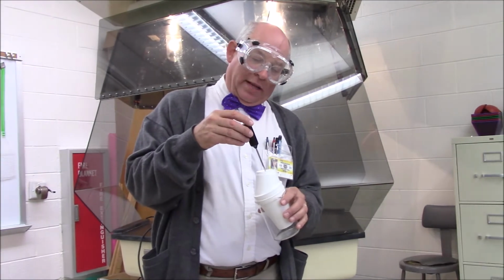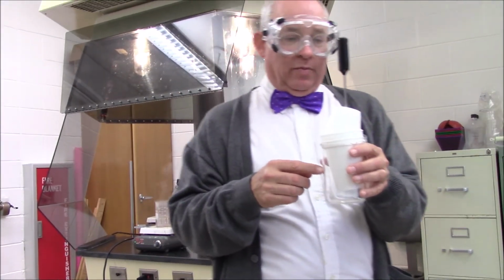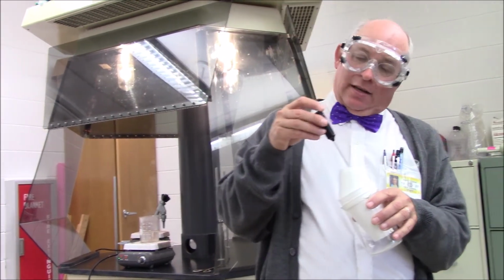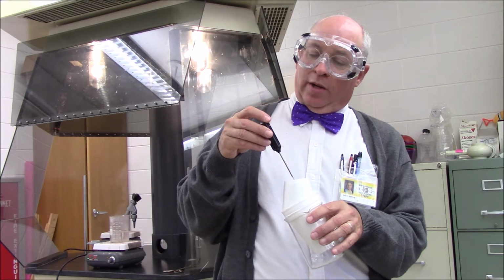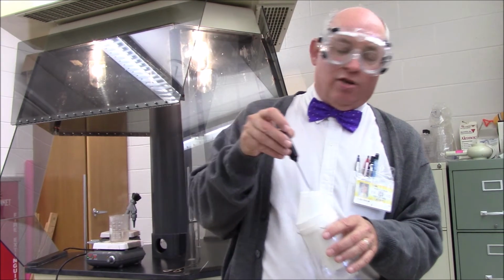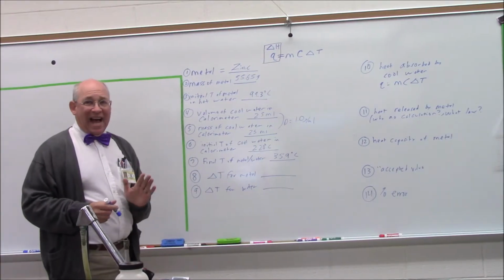One thing I want to keep in mind is, even though I'm only taking the temperature of the water, the metal and the water have the same temperature. It's a concept known as thermal equilibrium. So that's 35.9 degrees. So we have all of our data now.